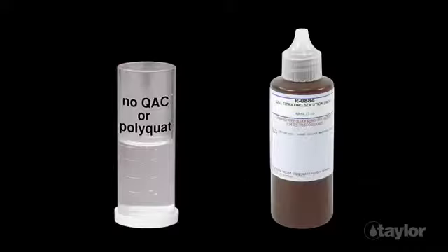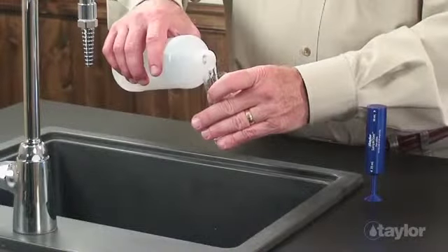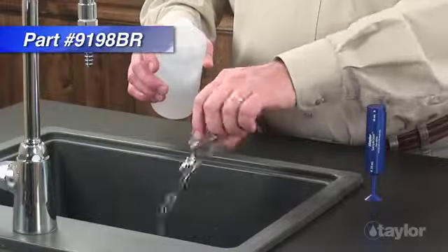Before testing the sample water, run a blank test using water containing no QAC or polyquat. Record the number of QAC titrating solution drops used. If any drops are needed, they will be subtracted from the results found in later steps. Rinse and fill the sample tube to the 25 milliliter mark with the water to be tested.